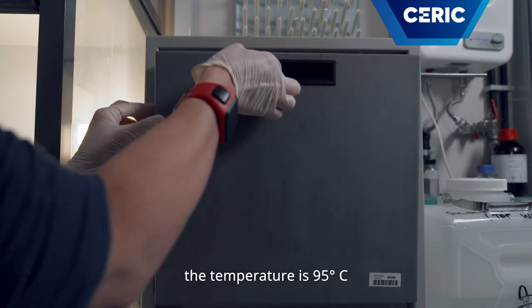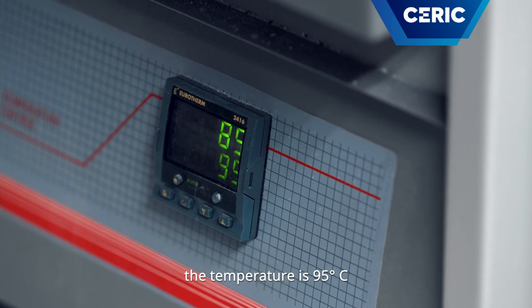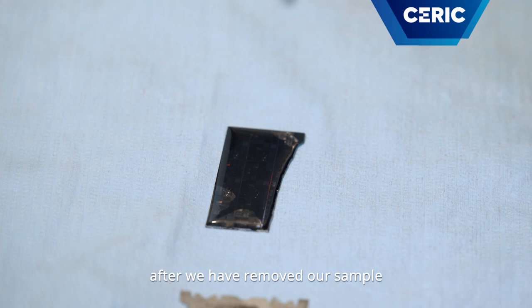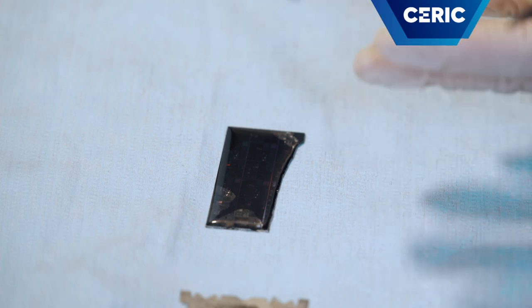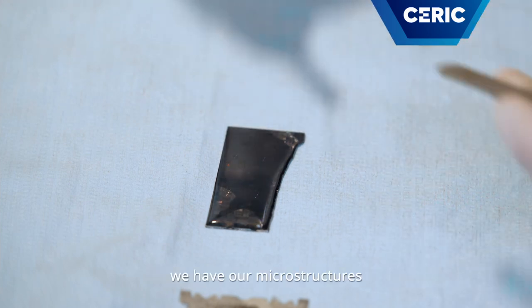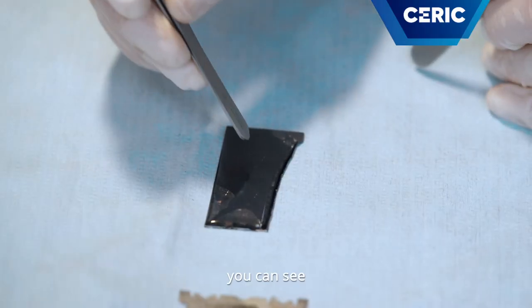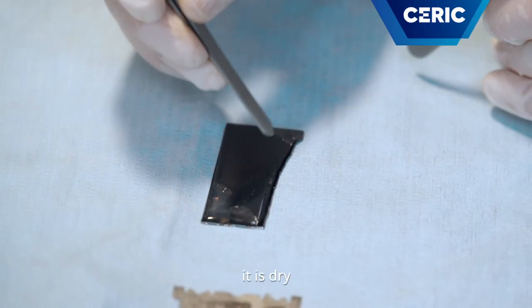The temperature is 95 degrees. After that, we have removed our sample from the oven and let it cool down. Now we have our microstructure with the PDMS above. You can see that now it is dry.